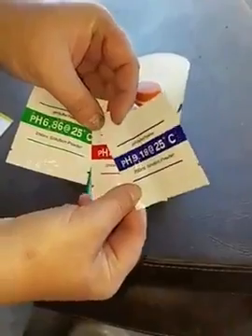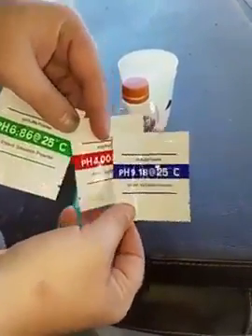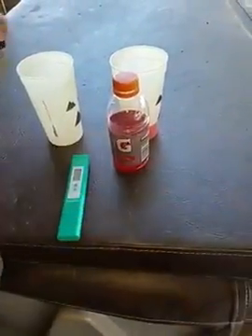But they do send you these powders so that when you're calibrating it, you can just dump in a cup and calibrate it real quick. I've already done a set, that's why I have just this set left. They send you 2 sets.